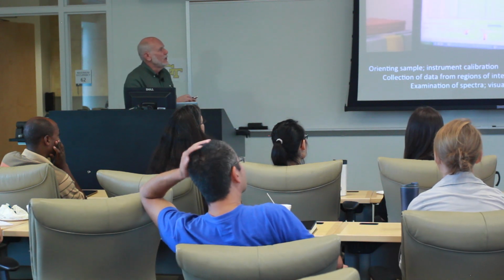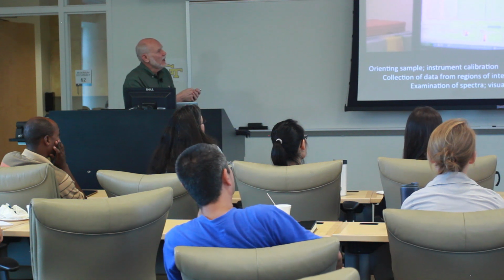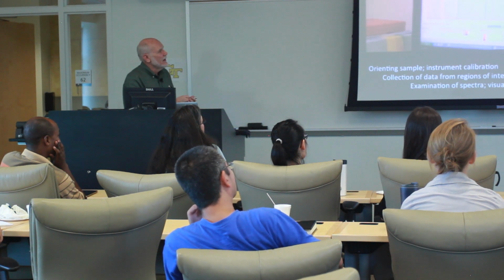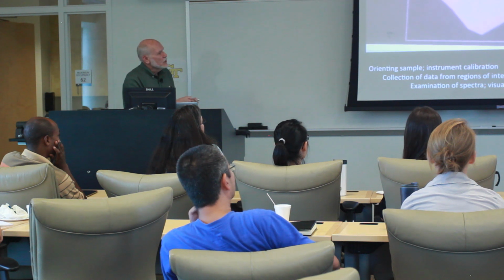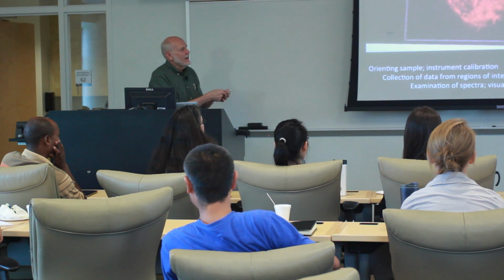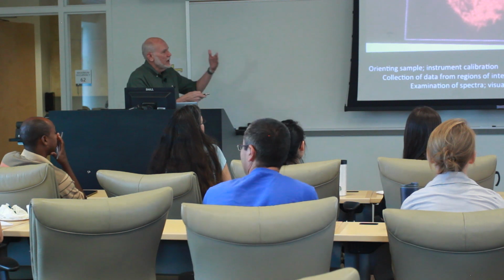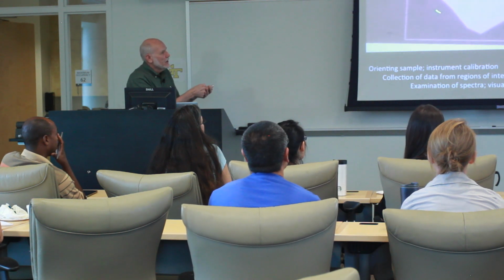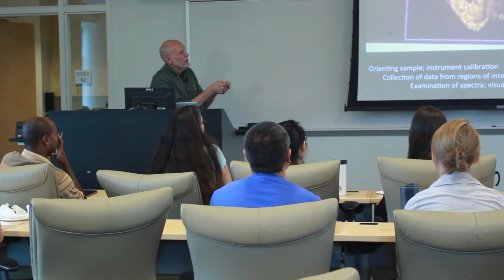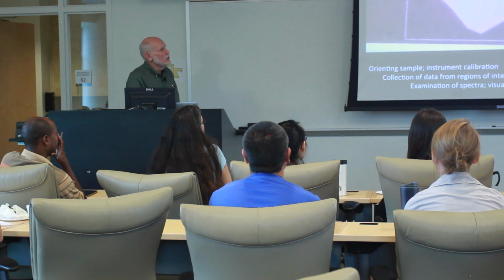And then zooming in a little bit closer, you'll see a little higher blow up what this could look like, the same scrolling through that group that you just indicated. So you typically have an outline that you sketch from a camera that's on the instrument, which is why we had that pattern around here. You then collect the spectra and display them as you want.